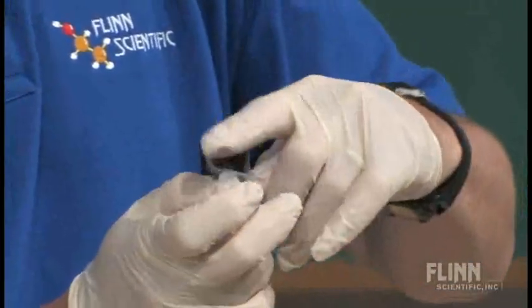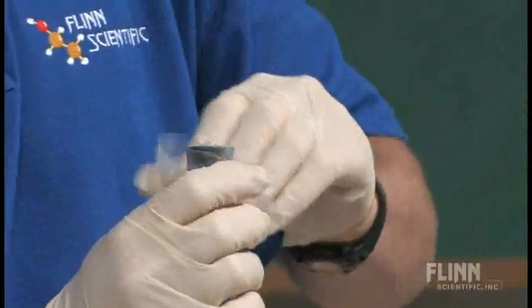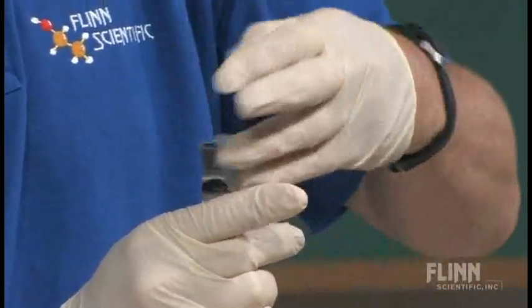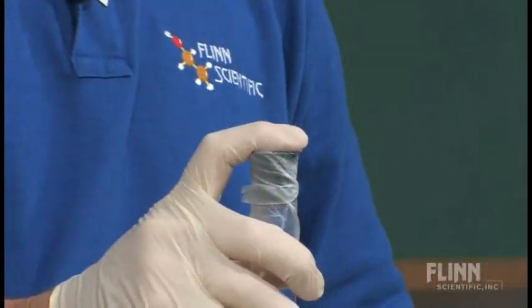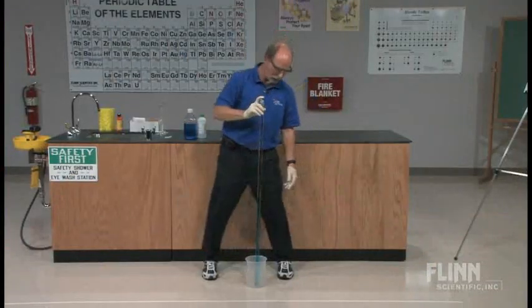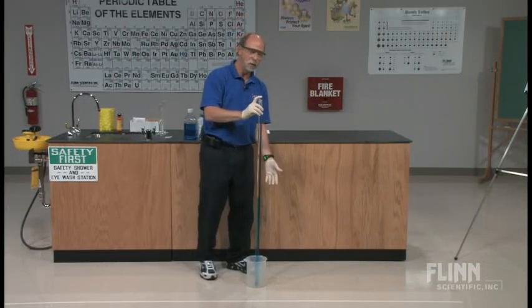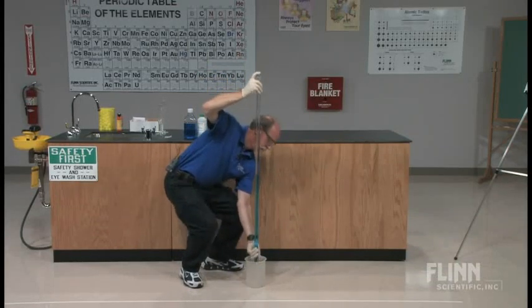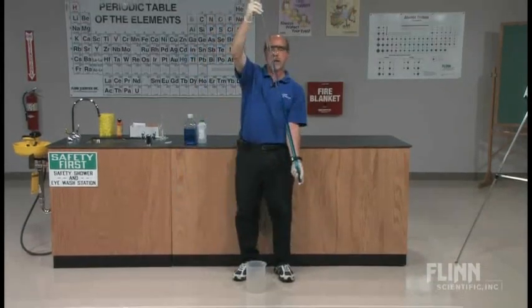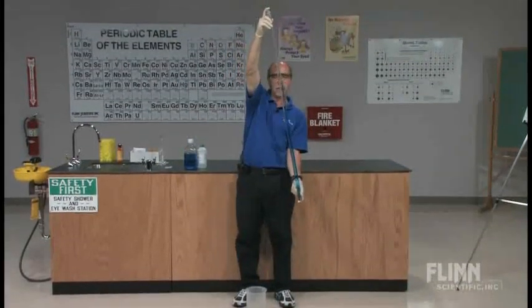All right, I'm going to seal this as best I can with another piece of parafilm, just a wax type paper. Now, I'm going to hold a finger on that stopper. I'm going to reach down and grab the other stopper, holding that in place. And now I'm going to proceed to invert this, and you can see there's an interface between the two.